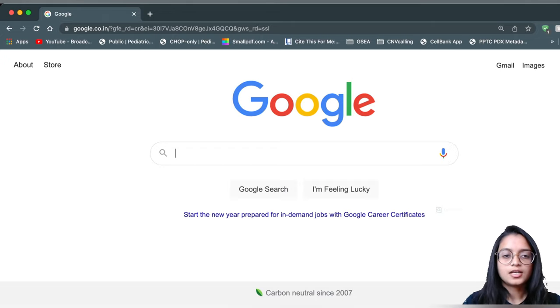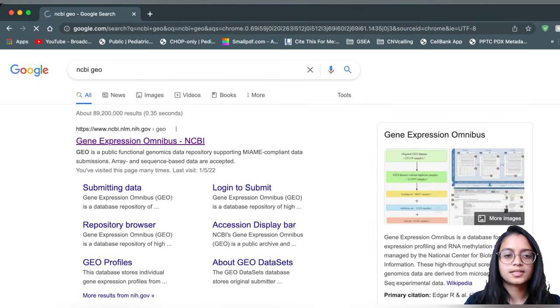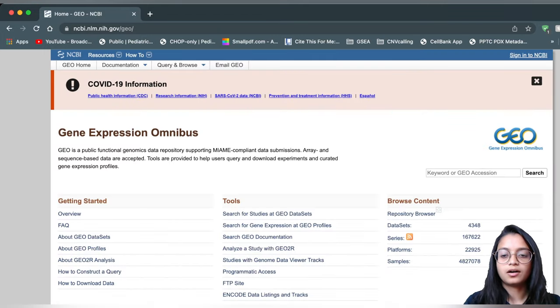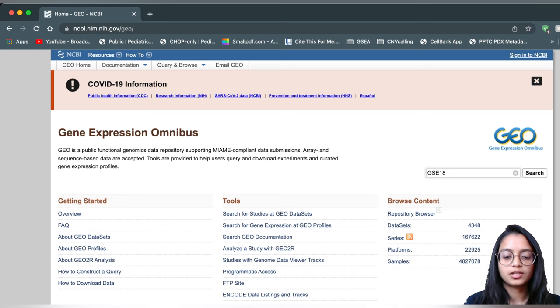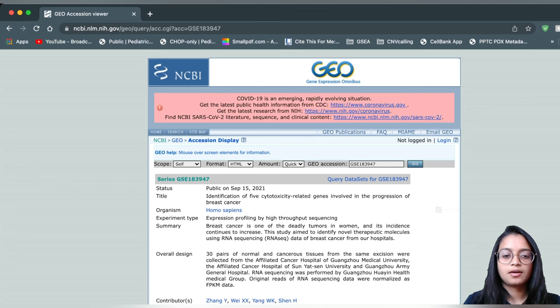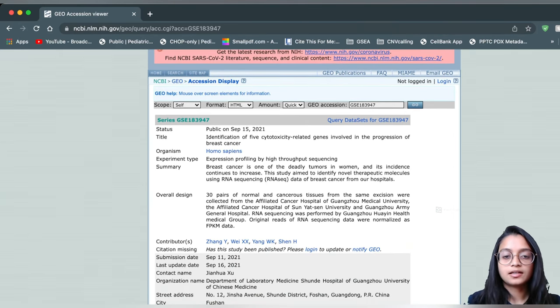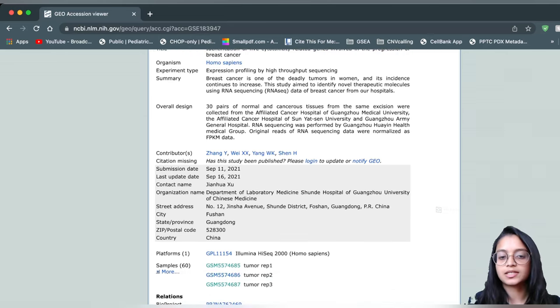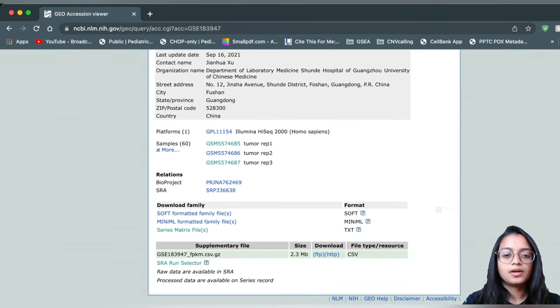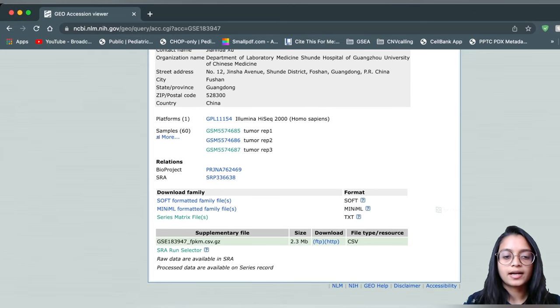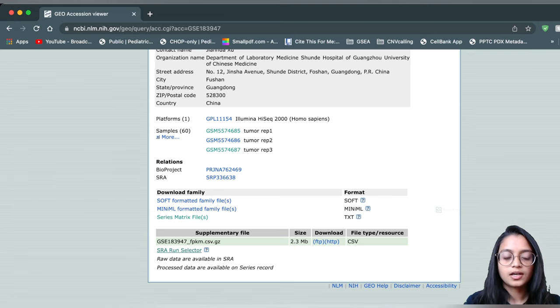Let's start by going to NCBI GEO, which is the same place where we retrieved our gene expression data. The GSE ID I'll be using is GSE183947 — this is the breast cancer dataset containing 30 pairs of tumor and normal samples, with data normalized as FPKM. This is the same dataset used in our previous videos. Today I'll scroll down and click on the SRA Run Selector because I want to retrieve the sequencing data rather than the gene expression data.